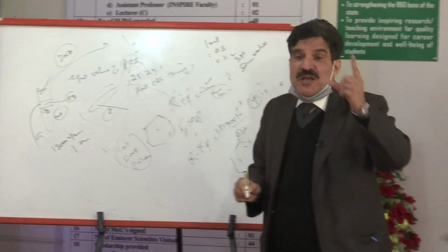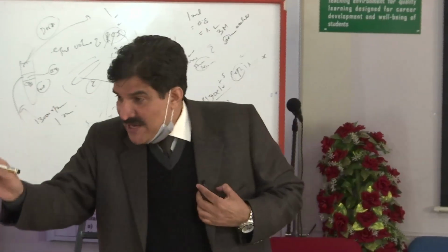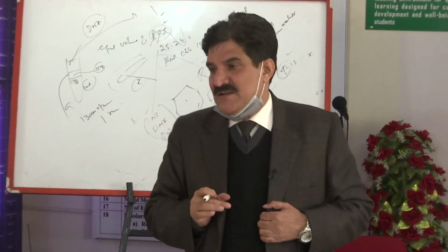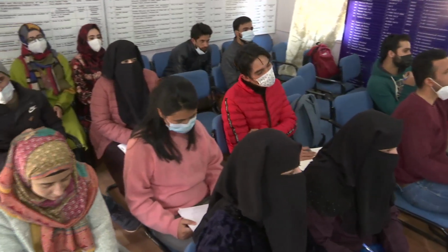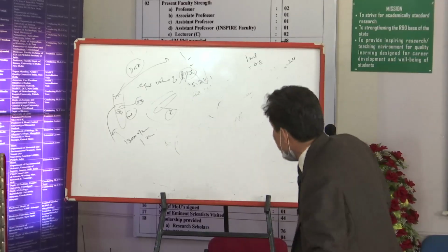If the aqueous phase is 1 ml, you are adding 0.1 ml of 3 molar sodium acetate. Overall it should be 0.3 molar, but in concentrated form it should be 3 molar sodium acetate. See what is happening.